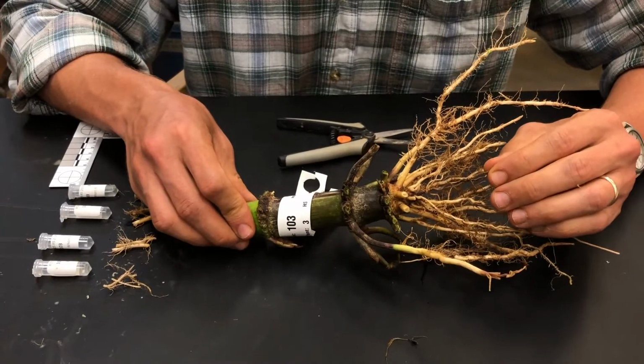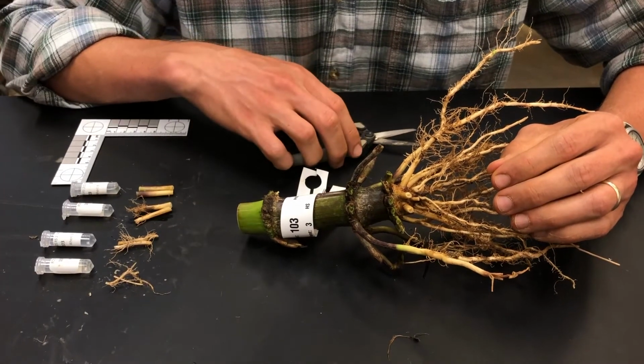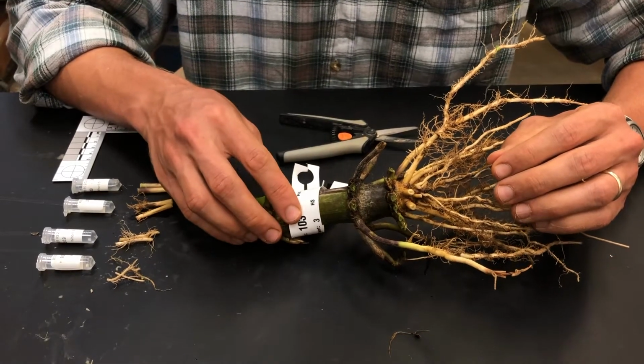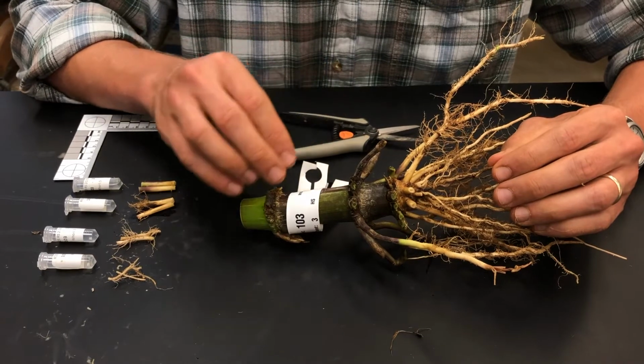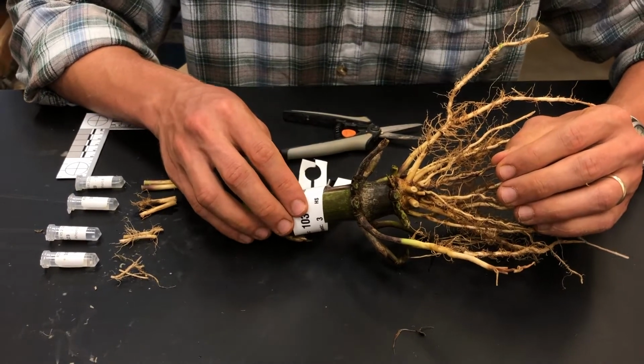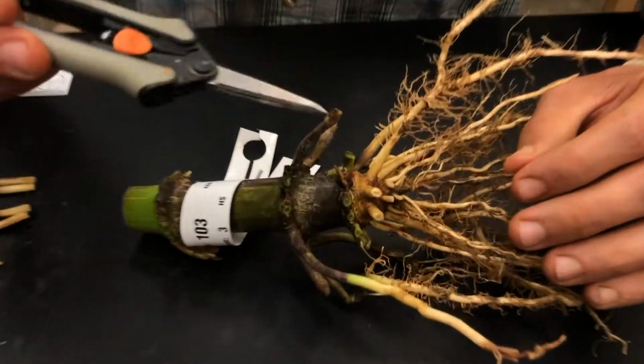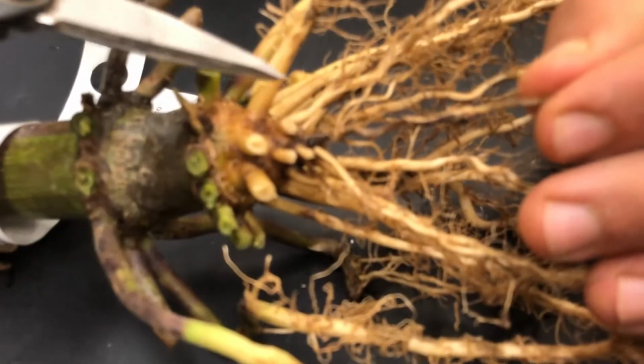Here we have a fresh maize root crown that was just excavated from the field, and we've taken it back to the lab to collect root samples for anatomical analysis. At first glance, this maize root crown may look like one big tangled mess of roots, but upon closer examination, we can see how the maize root system is organized into distinct root classes.